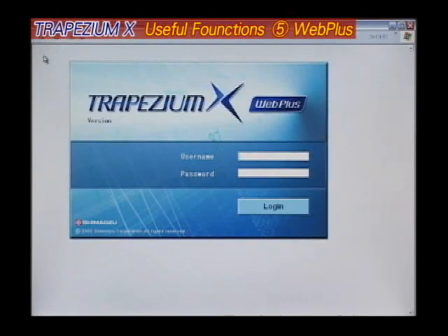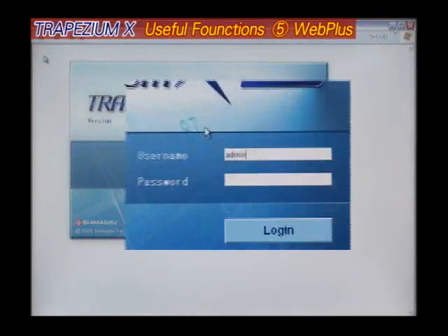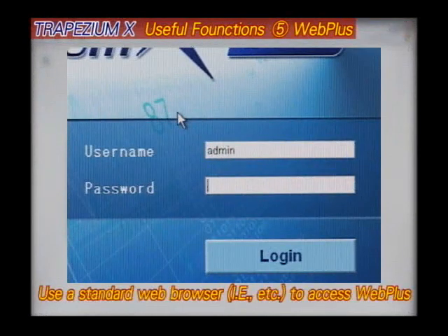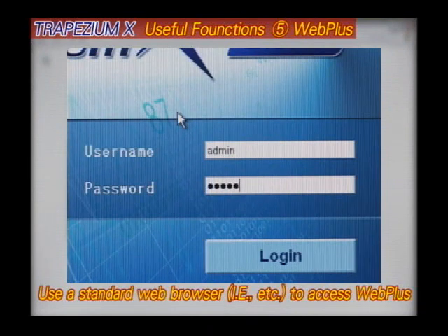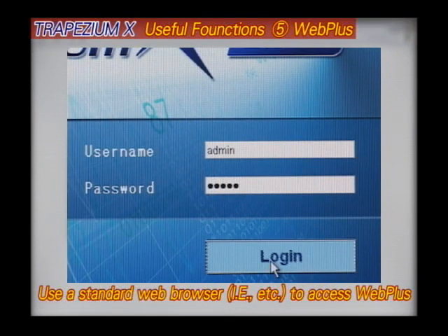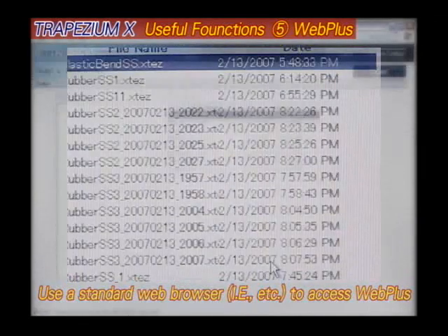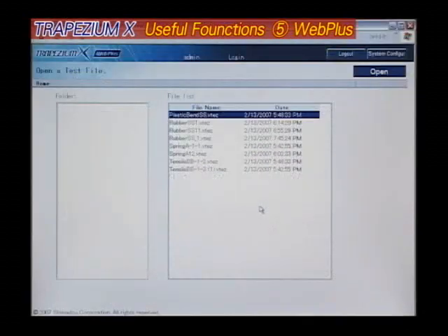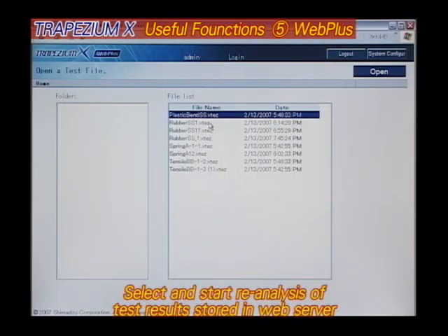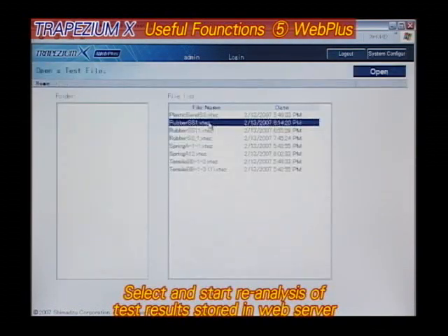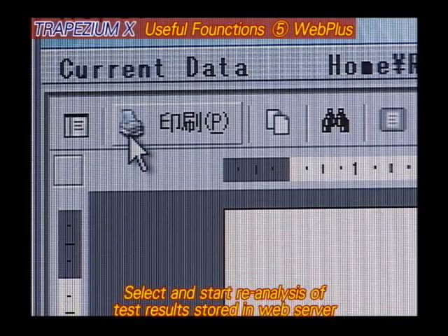Trapezium X provides full network compatibility, allowing test data and test parameters to be stored via an intranet LAN. New features allow the reanalysis or printing of data using Internet Explorer.